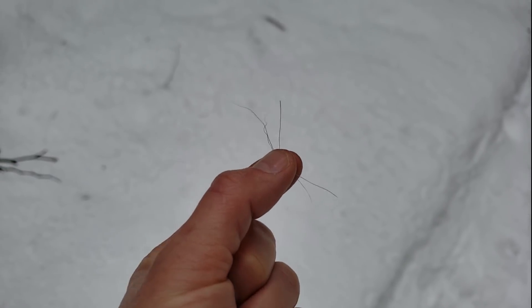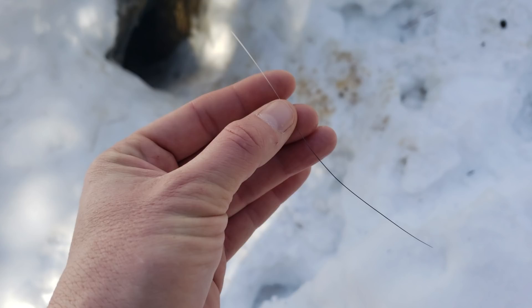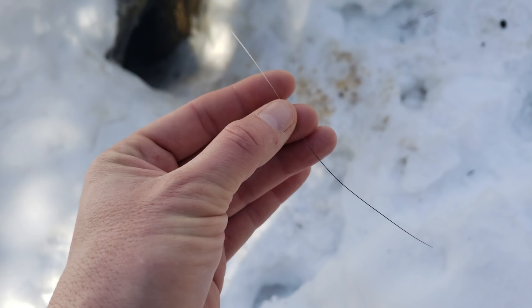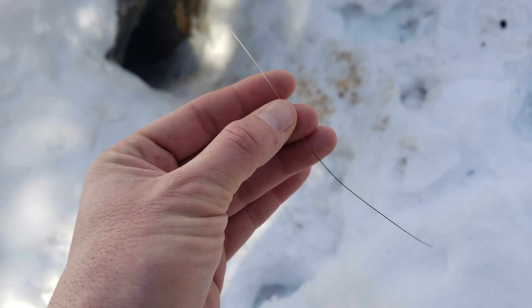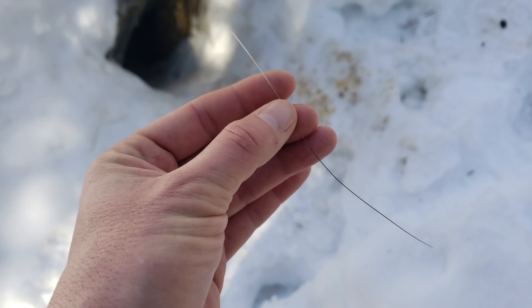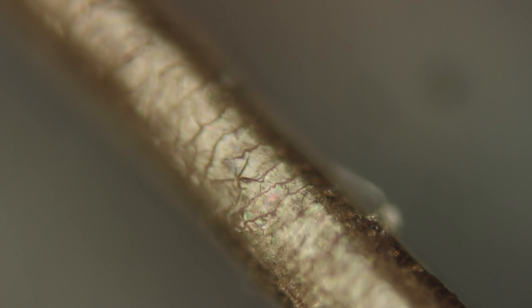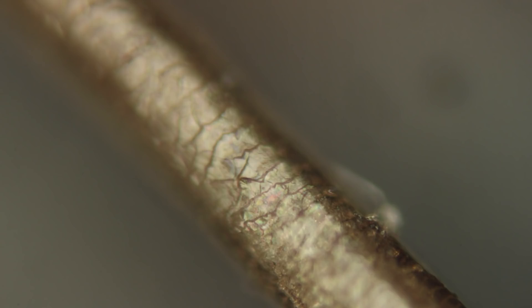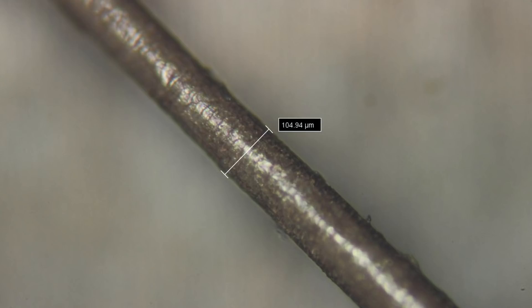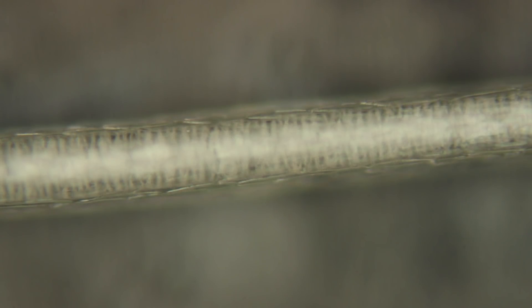Taking the coyote fur from near the den, we'll compare it to domestic dog and arctic fox hair. Coyote hair has some points of pigment and some areas of white. Coyote and wolf hairs usually have a black tip alternating with black and white bands, which helps distinguish between the two — the white band after the black tip in coyote hair tends to be a lot smaller than in wolf guard hair. Under the microscope the cuticle is imbricate, and the coyote guard hair is about 104 micrometers wide; wolf and coyote guard hair is generally less than 200 micrometers.